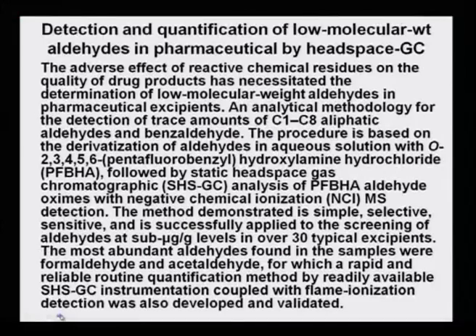The adverse effect of reactive chemical residues on the quality of drug products has necessitated the determination of low molecular weight aldehydes in pharmaceutical excipients. An analytical methodology for the detection of trace amounts of C1 to C8 aliphatic aldehydes and benzaldehyde. It is not easy to detect them otherwise.